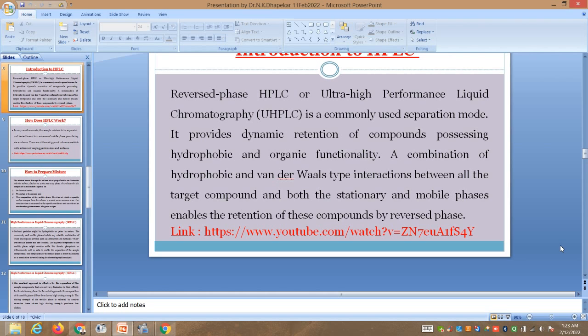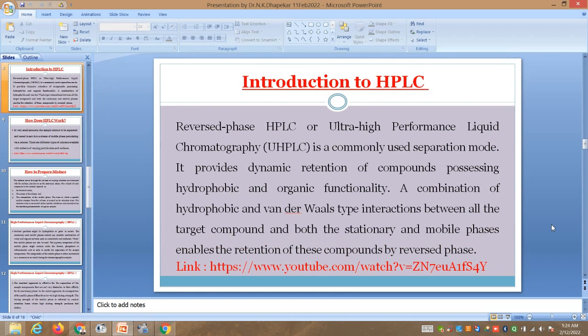So the molecule of interest in retarders used in chemical industries are sugar based molecules. If the charge of the sugar based molecules is positive, and we are using a negative stationary phase, then we can get good results. So, in chemical admixtures used in civil engineering, this HPLC is very much beneficial.